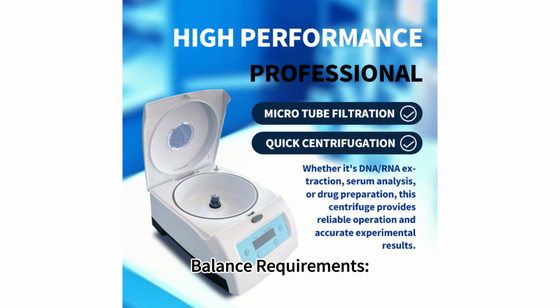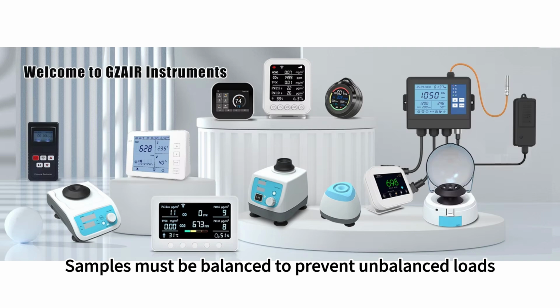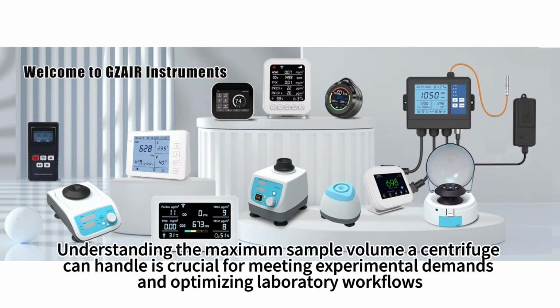Balance requirements factor: samples must be balanced to prevent unbalanced loads. Importance: maintains stability and prolongs the lifespan of the centrifuge. Understanding the maximum sample volume a centrifuge can handle is crucial for meeting experimental demands and optimizing laboratory workflows.